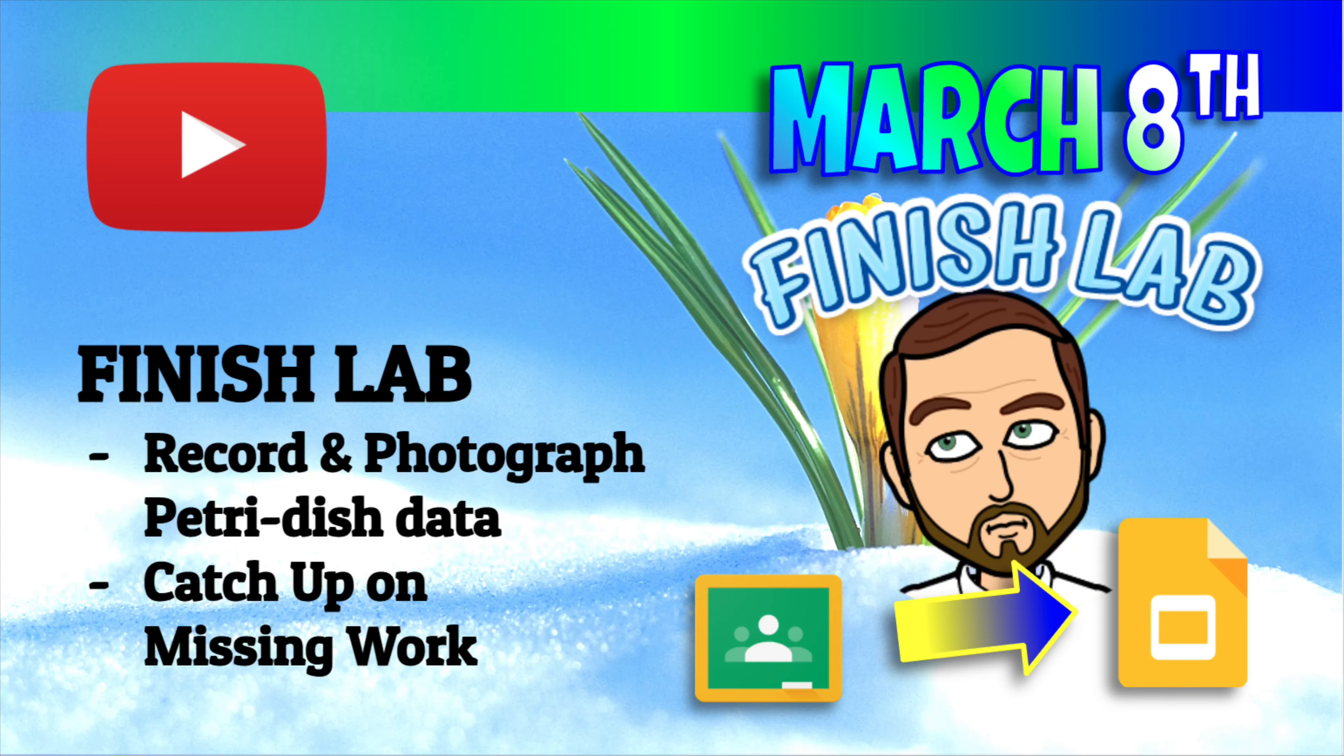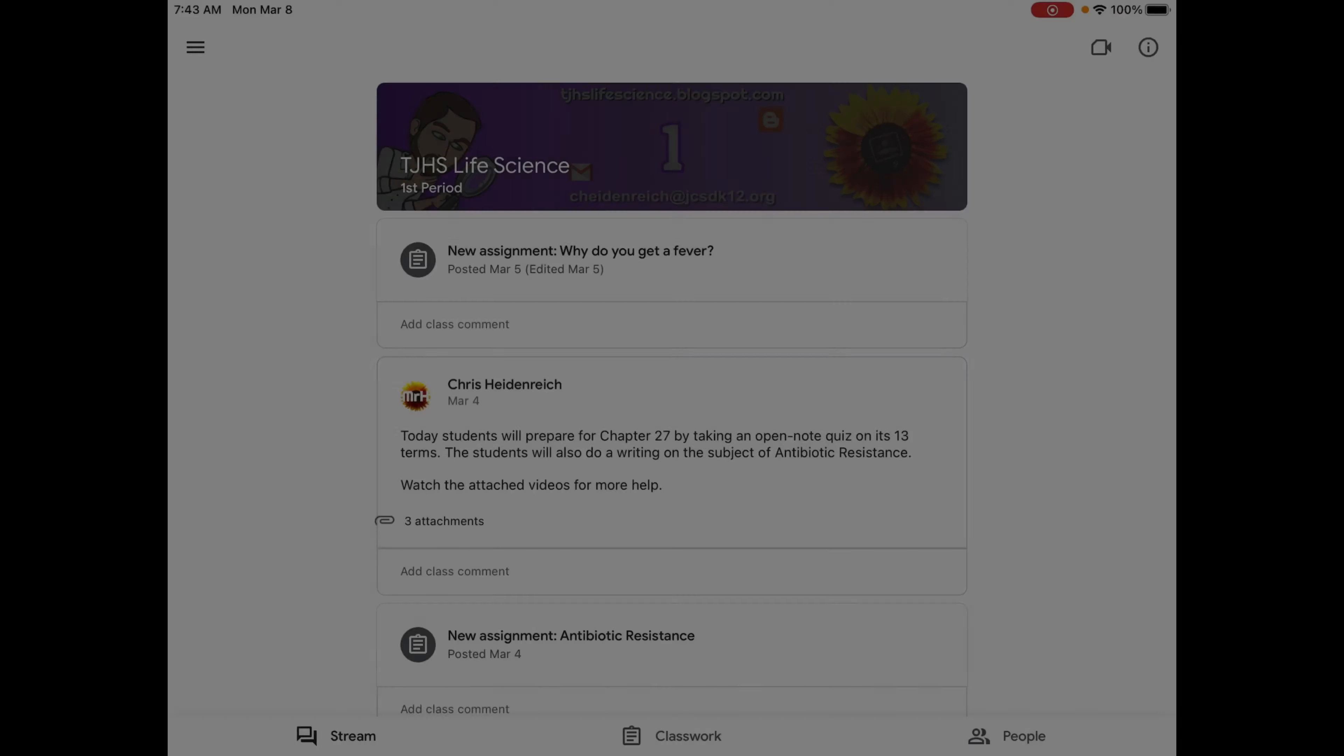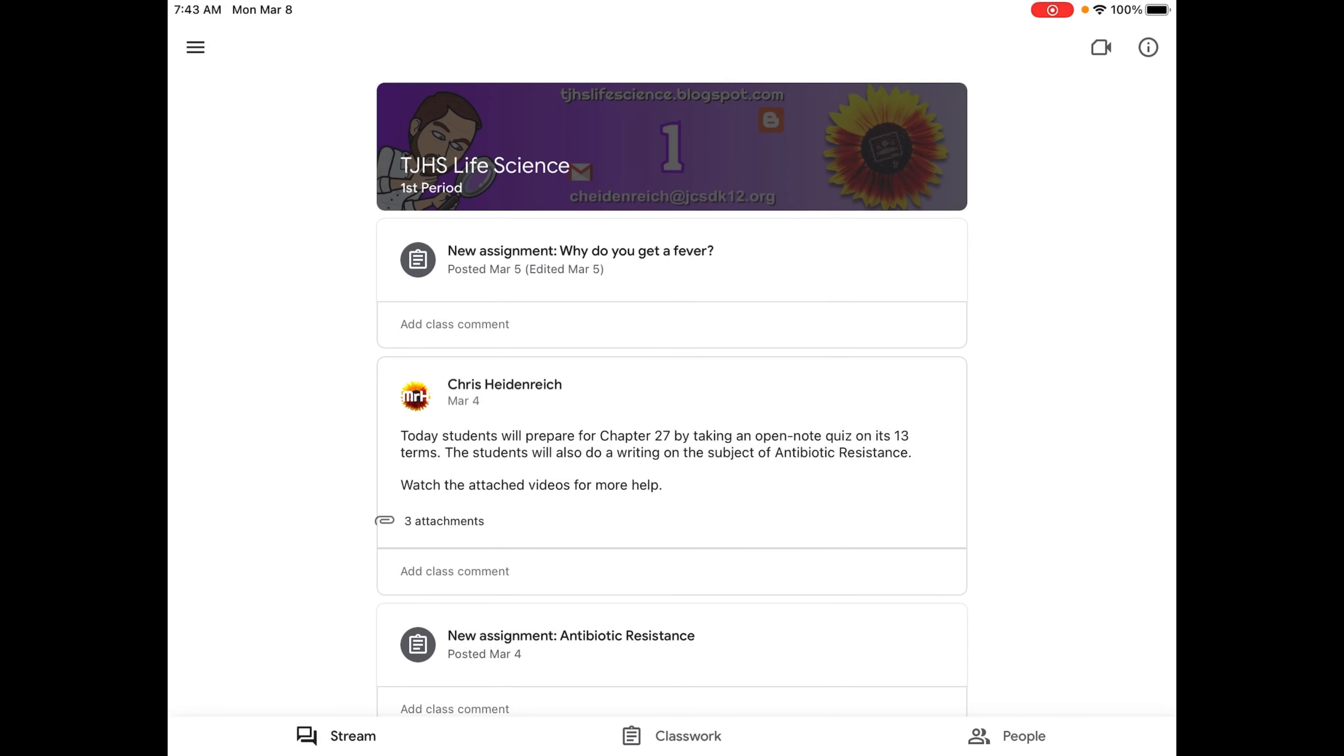Good morning. Alright, so today we are checking our petri dishes to finish our contamination lab.